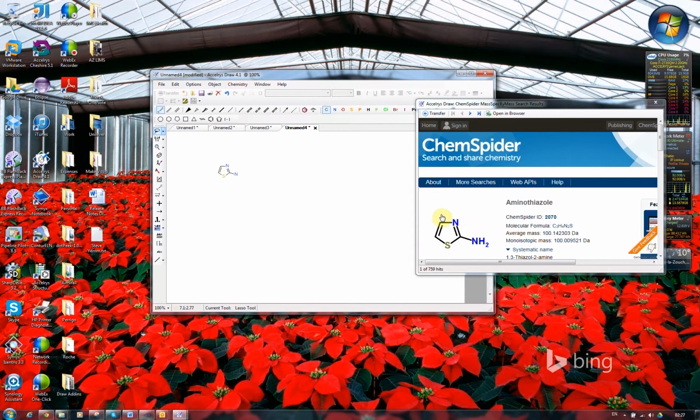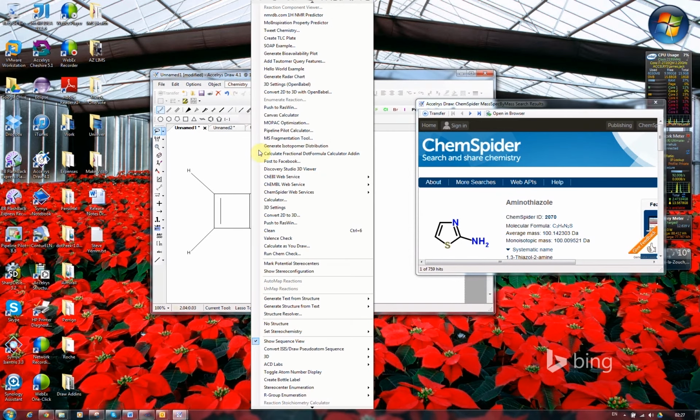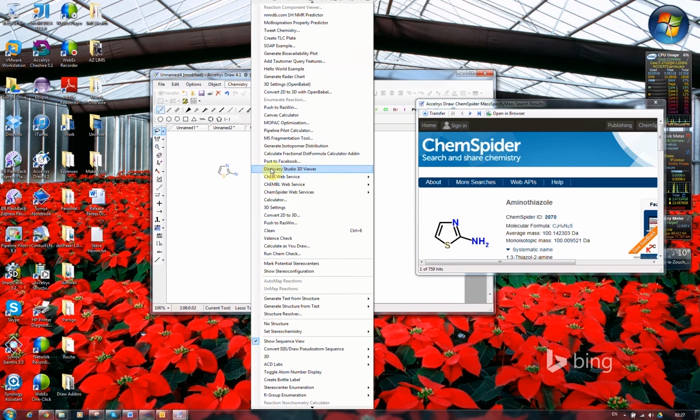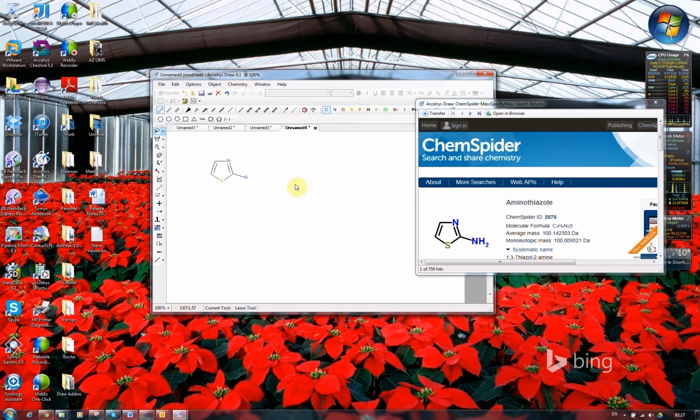Obviously ChemSpider generates these images of the structures, but the underlying source is whichever database provider it's come from. So the way the actual mol file is laid out is more variable than perhaps it should be, but I could do some cleaning up. We could obviously go and do a clean on some of these and improve their appearance. But I think it's a nice new add-in.